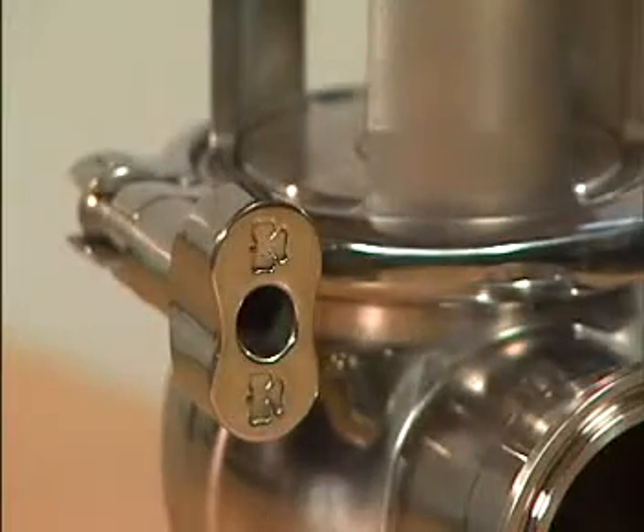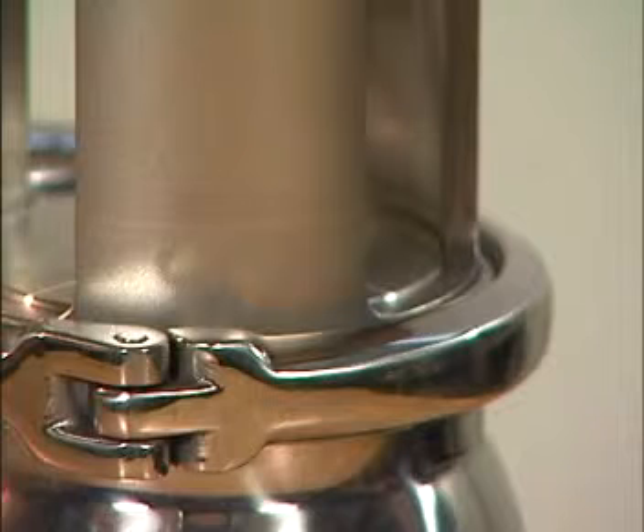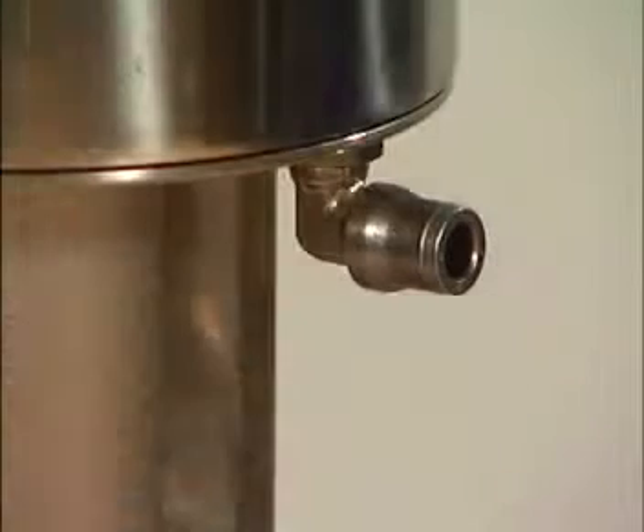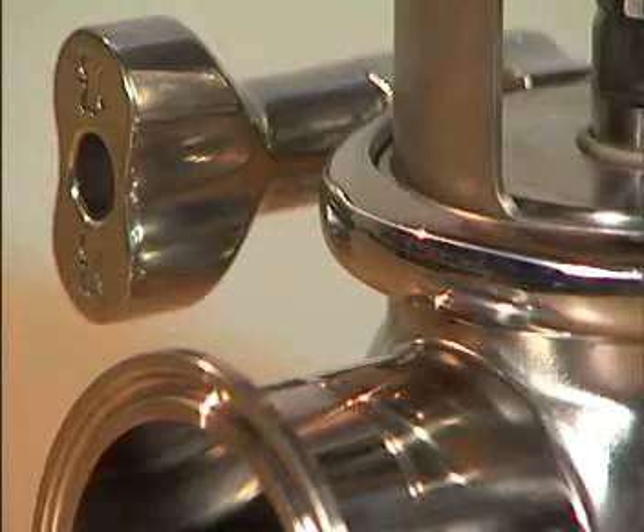A unique feature of this valve is the ability to rebuild from hygienic to aseptic, changing only the valve plug stem and bonnet. This video illustrates the rebuild of a shut-off valve, but the principle also applies for a changeover valve.